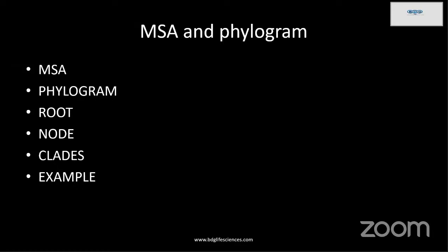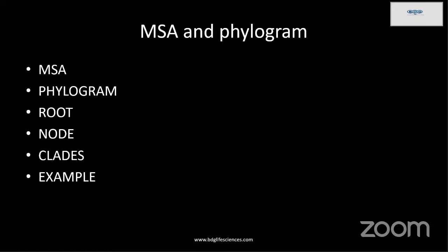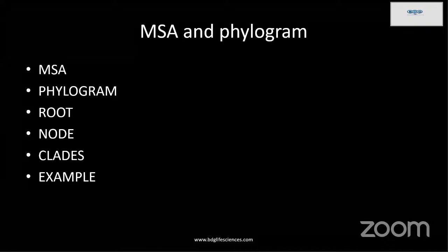Multiple sequence alignment is when you consider more than 2 sequences. Like we performed BLAST for 2 sequences, multiple sequence alignment is only the extension of it. At a time, you can consider more than 2 sequences, about 15 to 20 at a time. On the basis of this, there are different tools for getting multiple sequence alignment. Clustal W is the first one which was introduced. Then Clustal Omega is the modification of Clustal W.